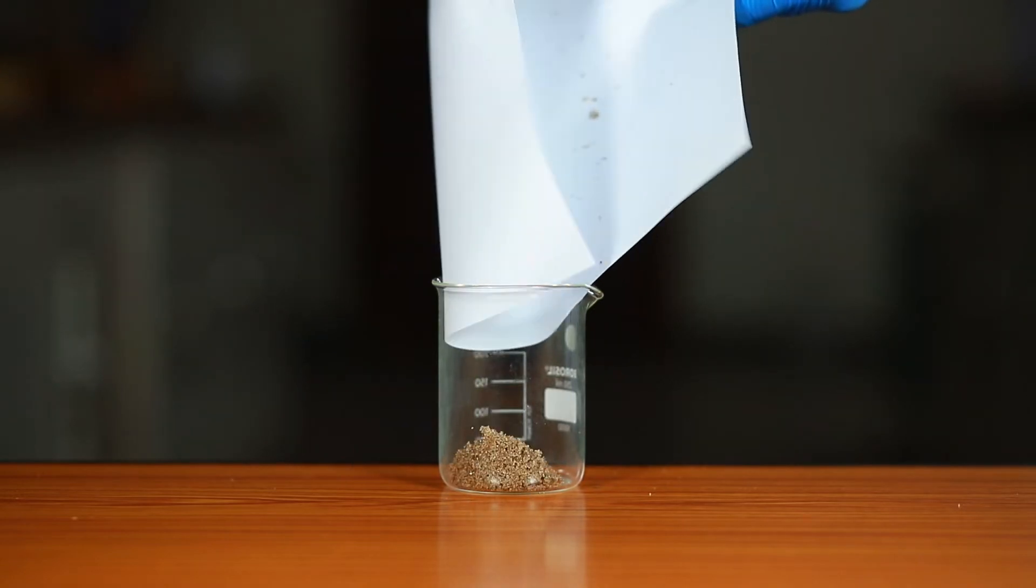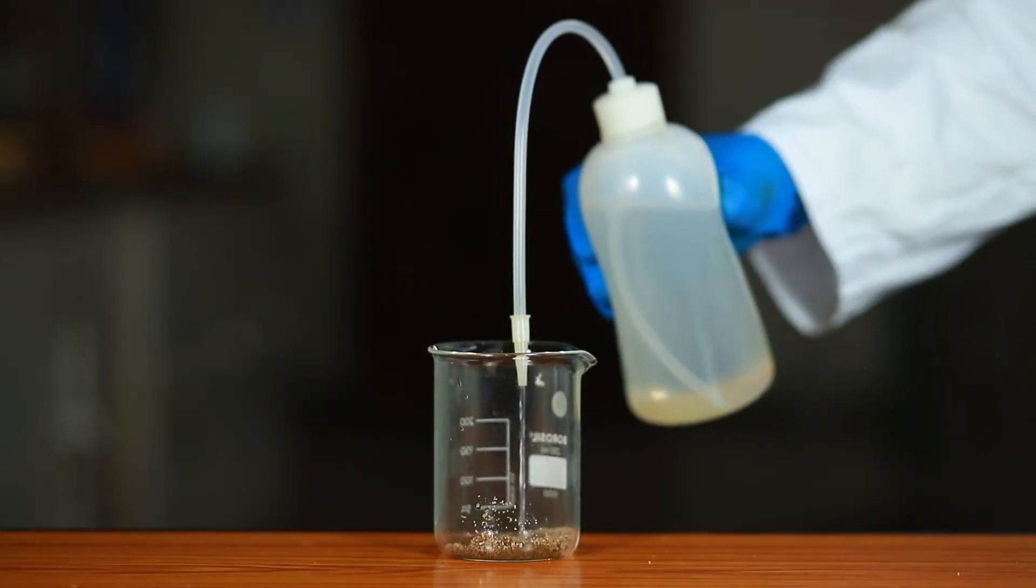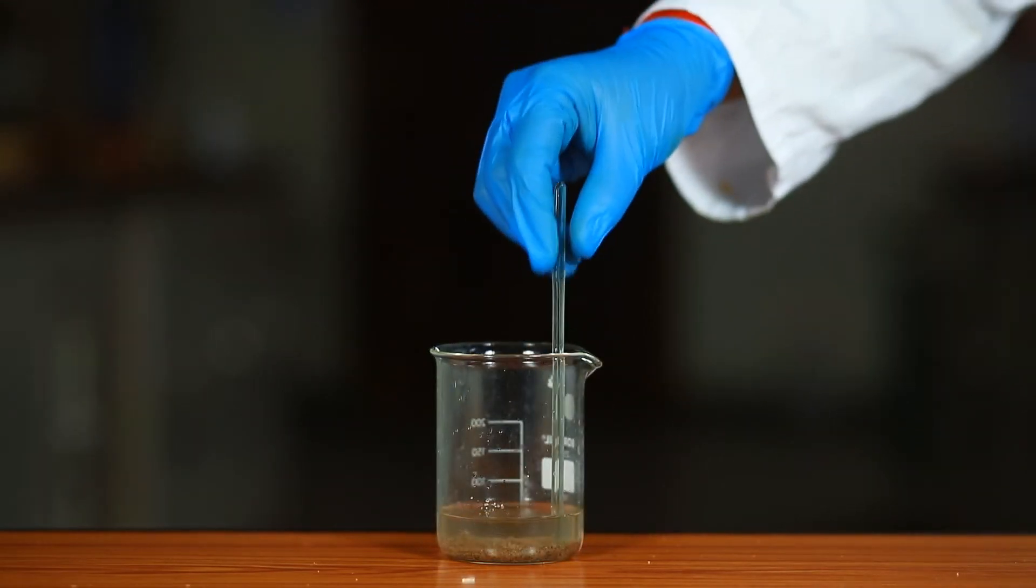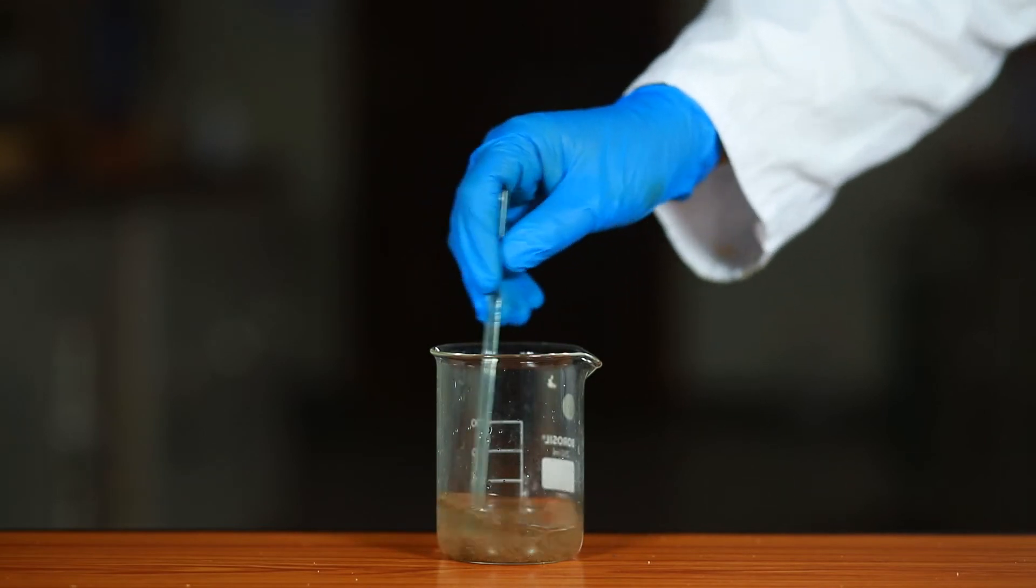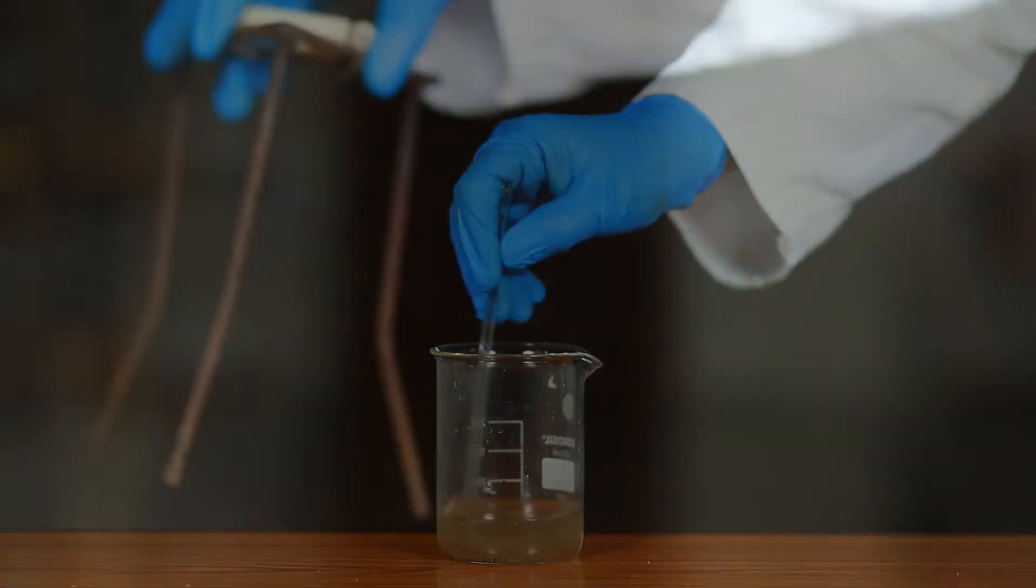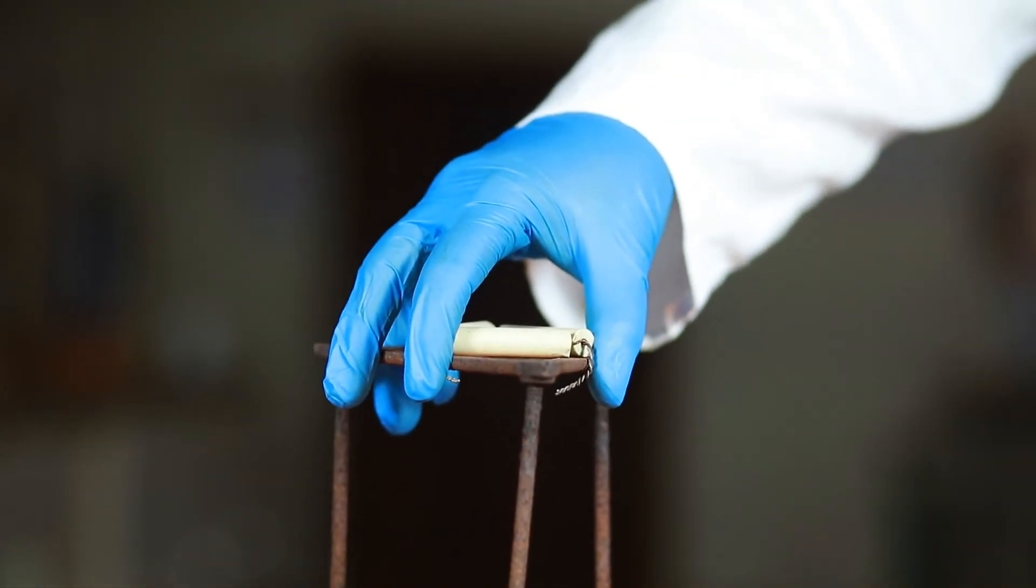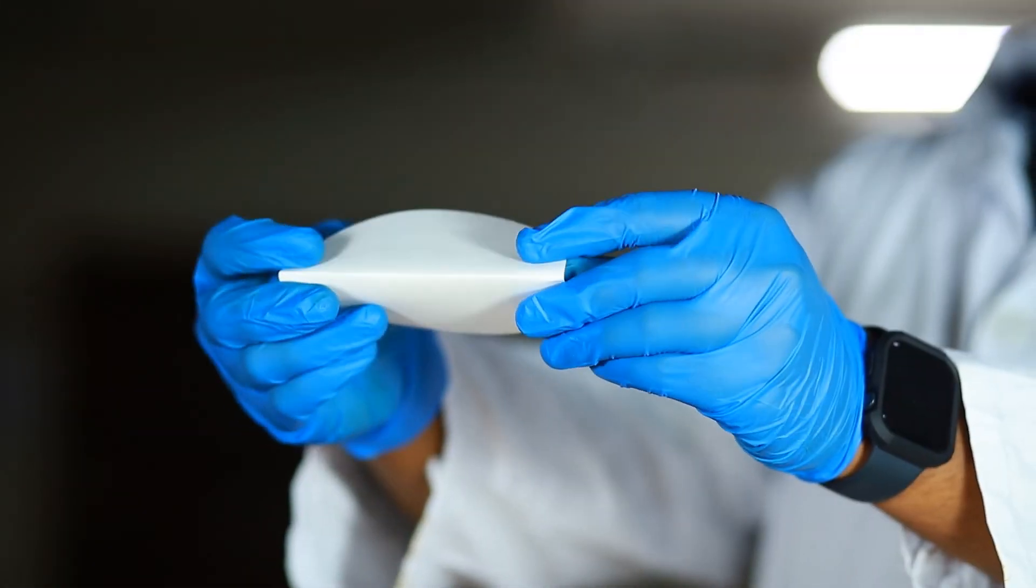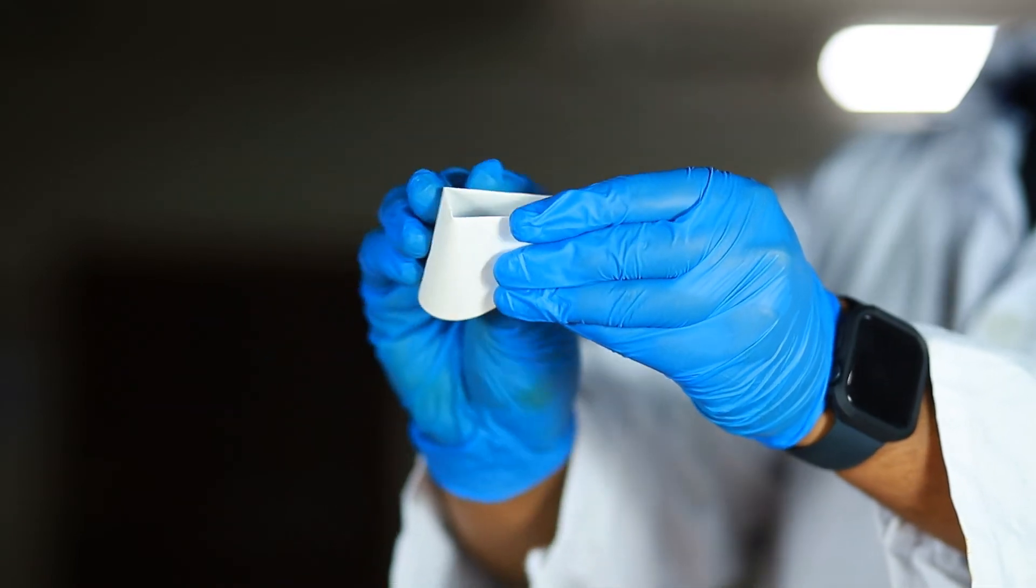Add a sufficient amount of water using a wash bottle to cover the mixture. Stir the contents of the beaker with a glass rod for some time. Place a tripod stand, keep the funnel in the tripod stand. Fold the filter paper and place it inside the funnel.